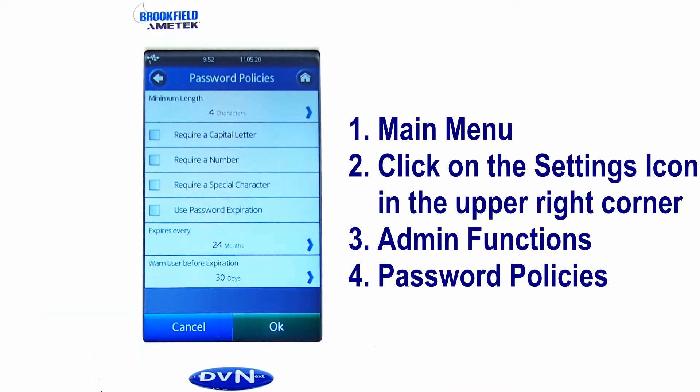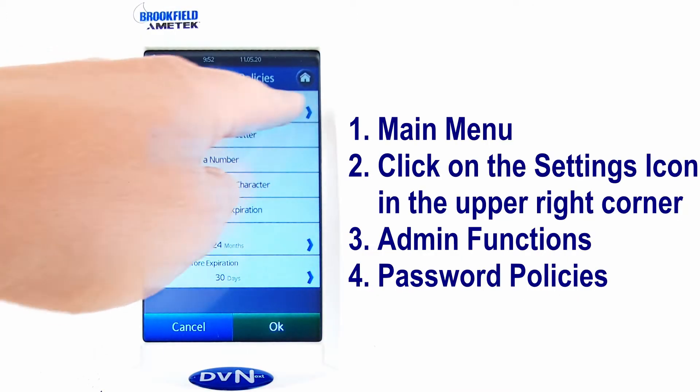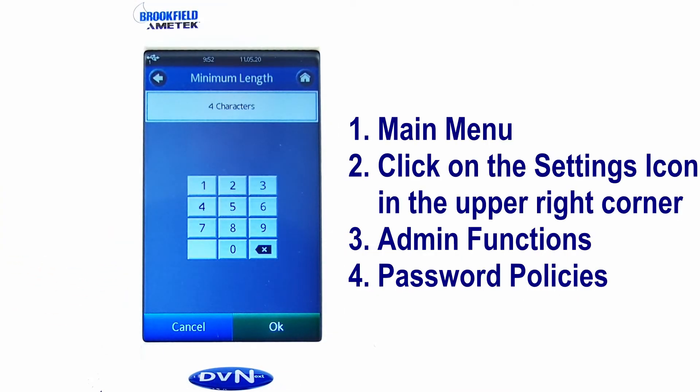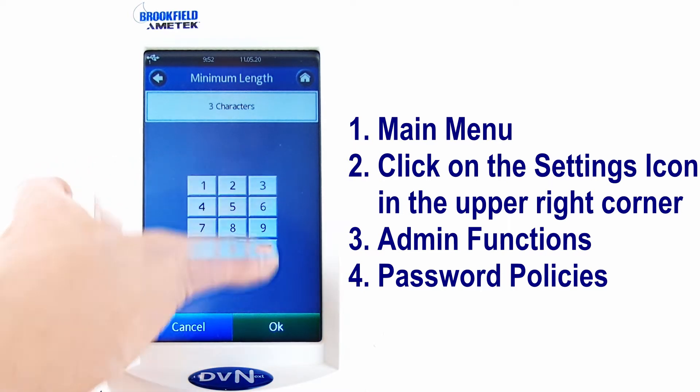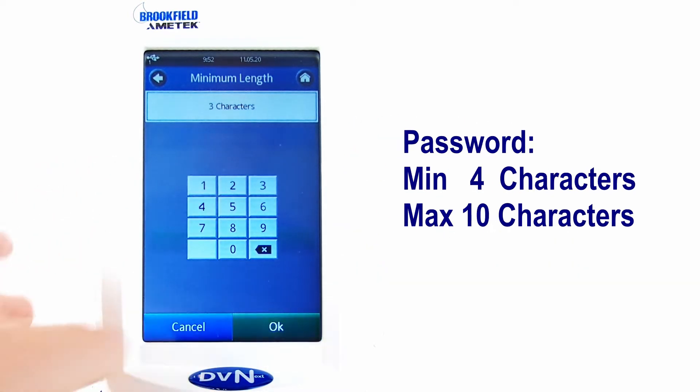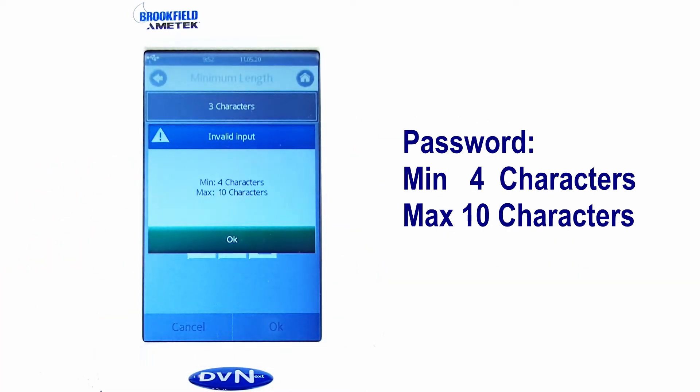Since I have weekly requests because someone has locked himself out, the first thing to do is to set the password policies.